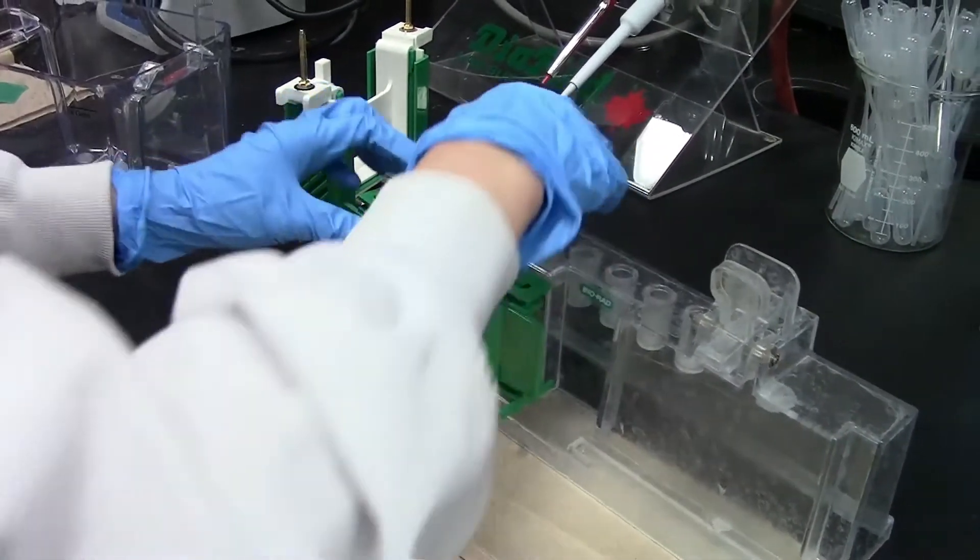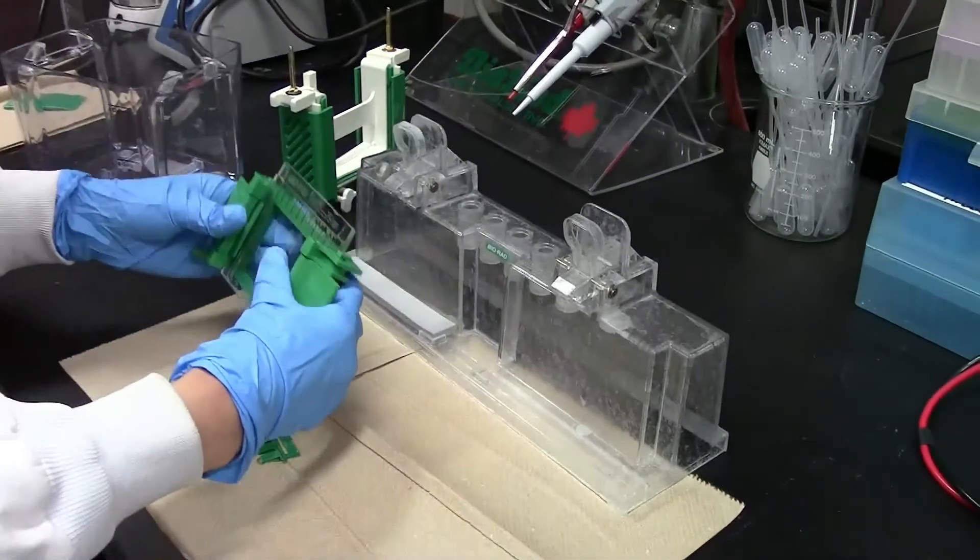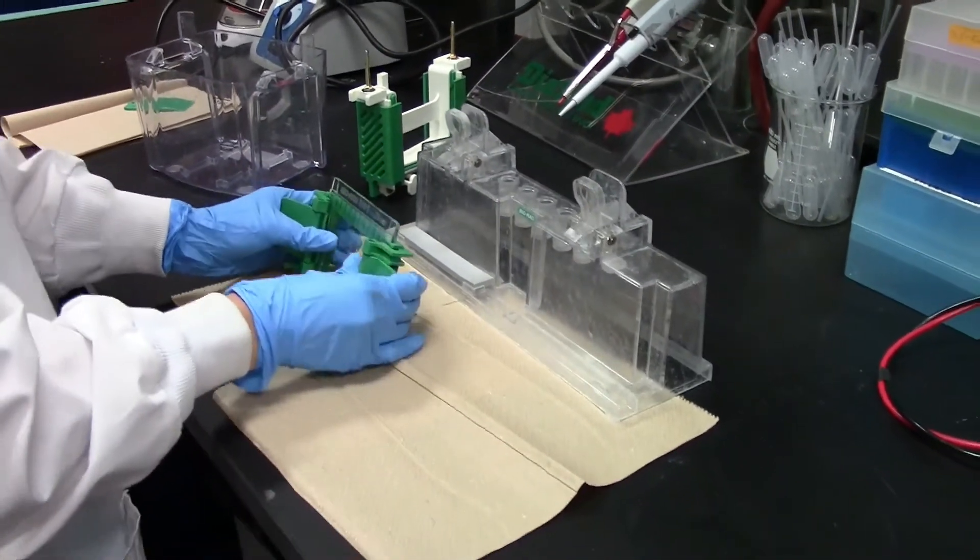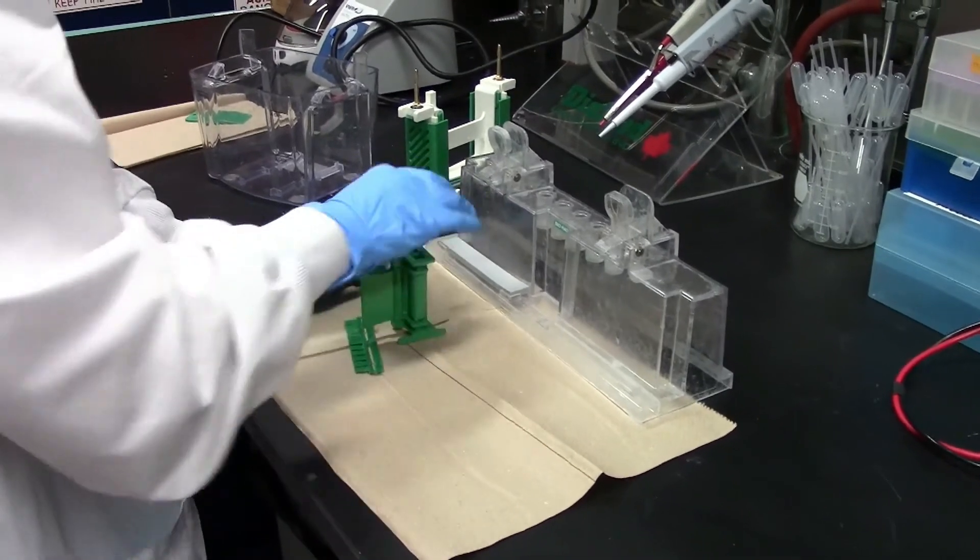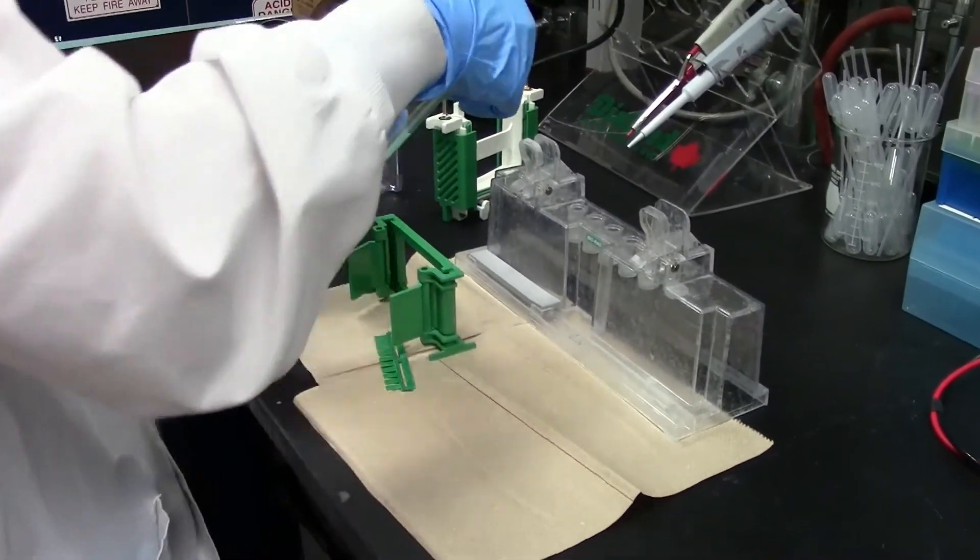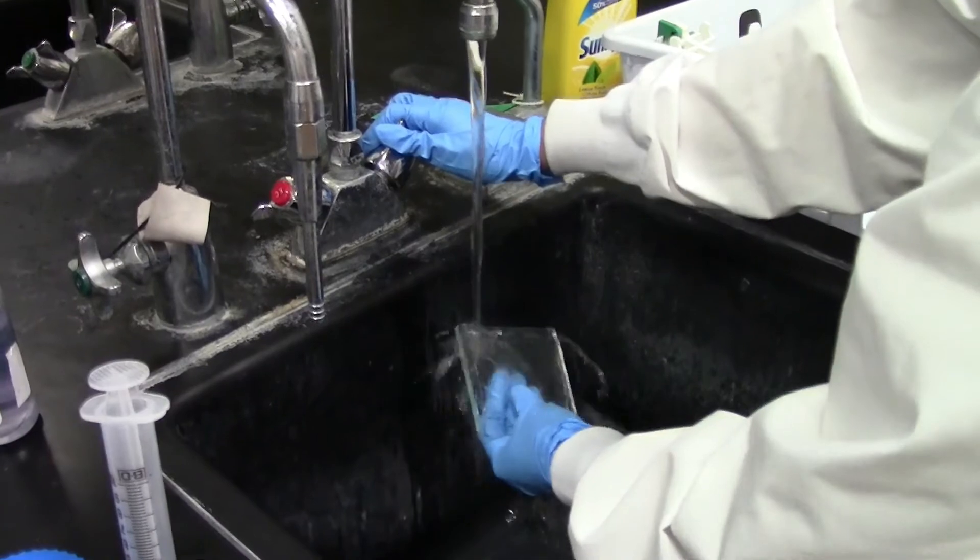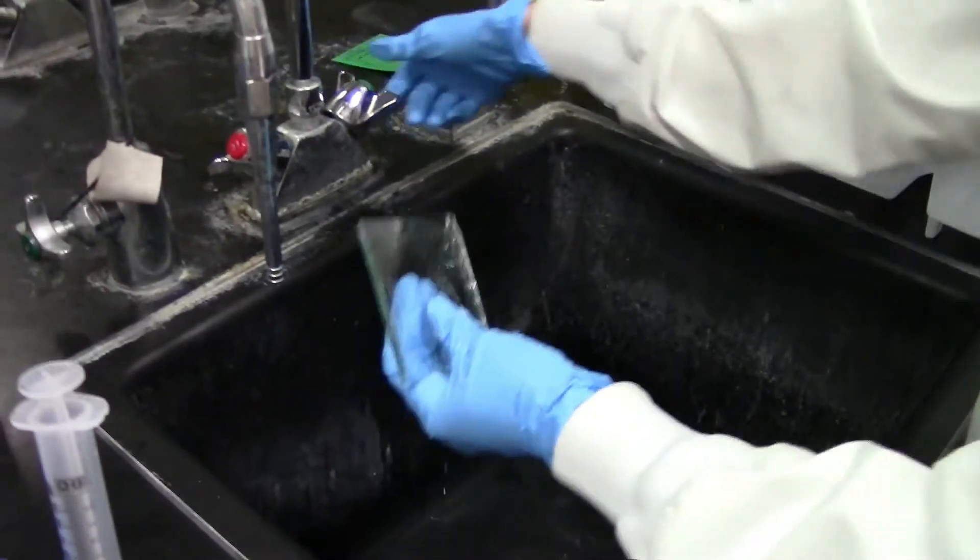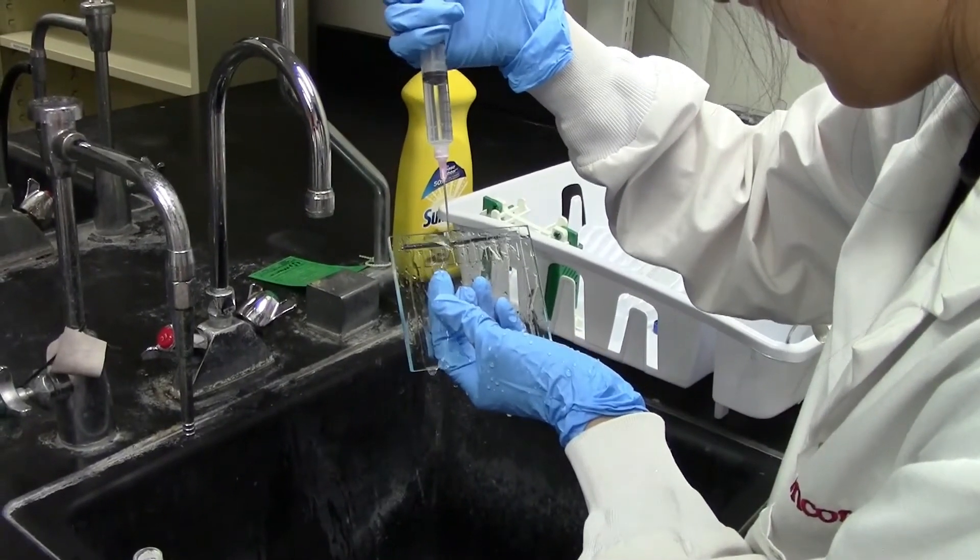After about 20 to 30 minutes, your gel should have polymerized. Gently remove the comb from the wells and remove the plates from the casting stand and casting frame. Once released from the apparatus, you should rinse the wells with water, followed by rinsing the wells with the same buffer that you will be using for gel electrophoresis.